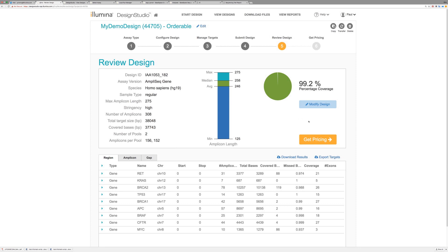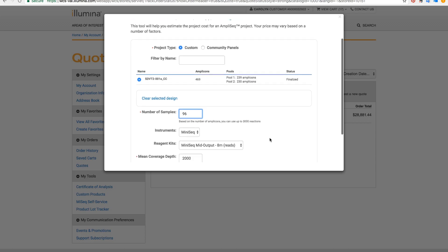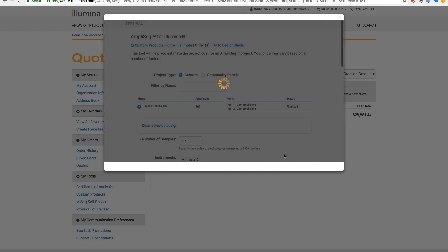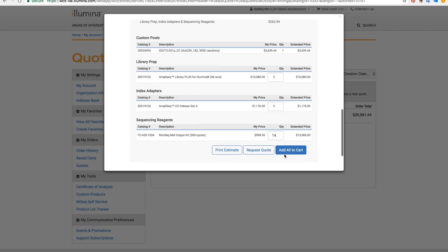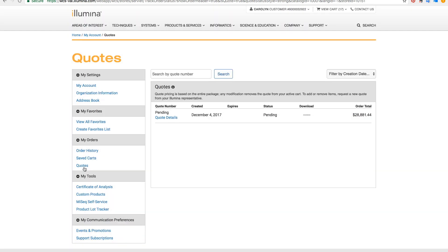If you're happy with your design, just click the Get Pricing button. This takes you to your My Illumina account, where you will get a pricing estimate for your project needs. You can add all to cart and checkout directly, like with any other Illumina product, or you can request a quote. Your quote will be generated within one to two business days. When your quote is ready, you will be able to redeem it from the Quotes section in your account.